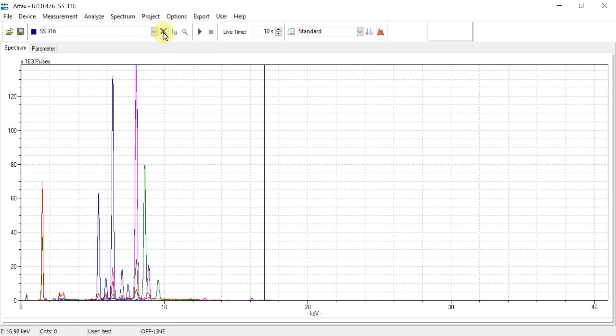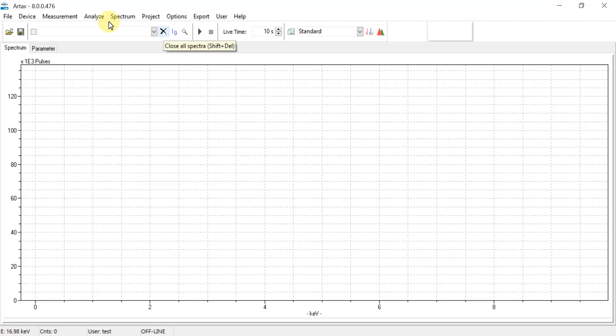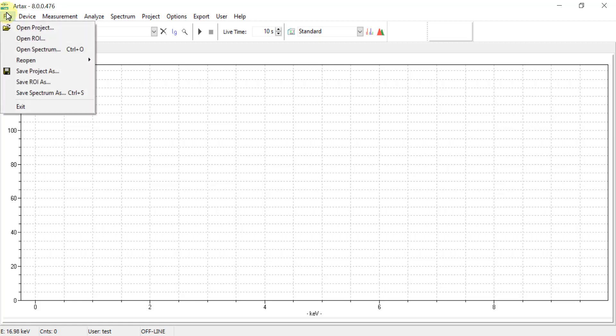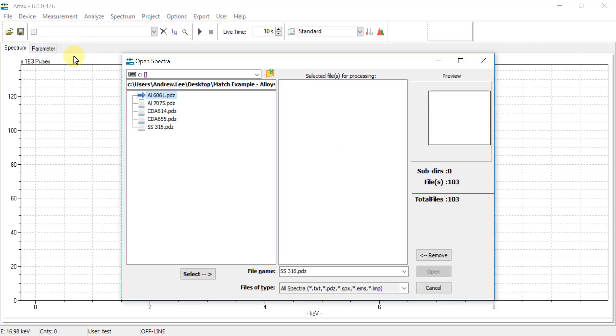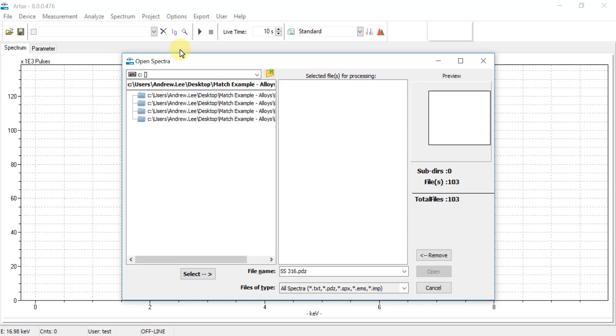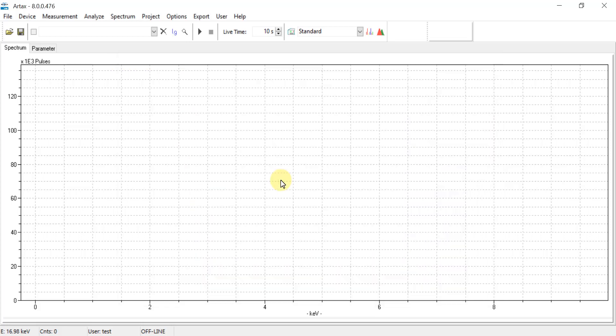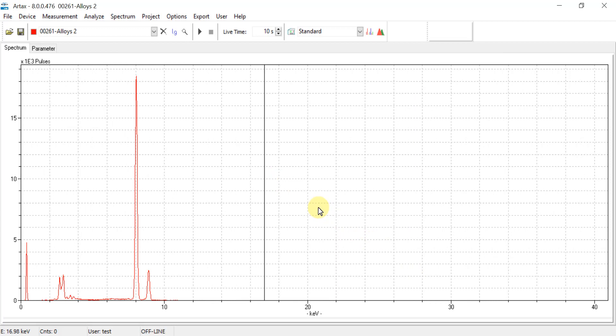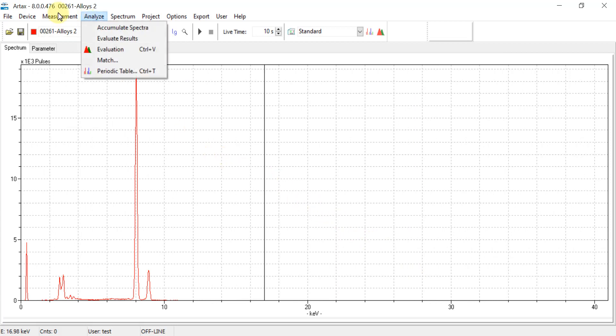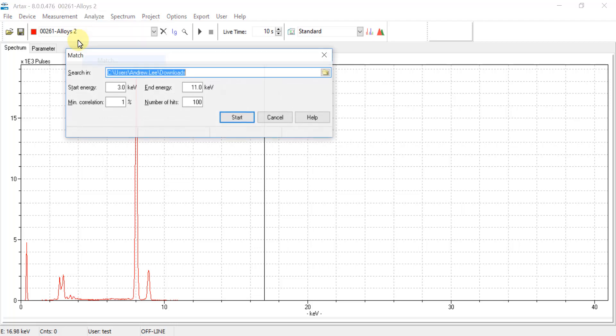Once all libraries have been created and stored, exit the project window by going to Project, Close Project, and clear out any existing spectra from the spectrum viewer. Now we are ready to open the unknown sample PDZ file. So we go to File, Open Spectrum, and find the folder where the unknown samples are stored and select one of the PDZ files to open.